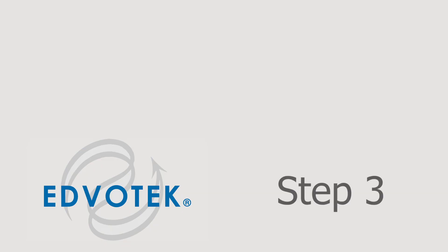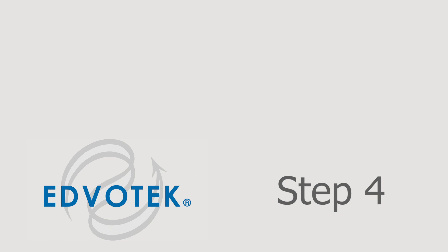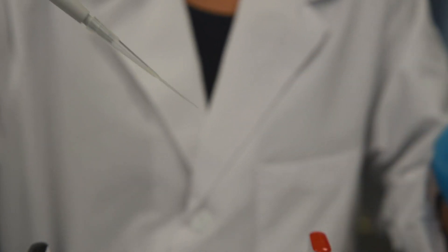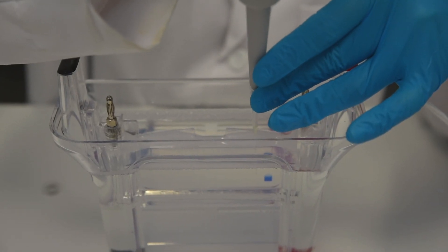Step 3: Slowly dispense the sample by depressing the plunger. Step 4: Repeat steps 1 through 3 for the remaining samples, changing the tip between each new sample.